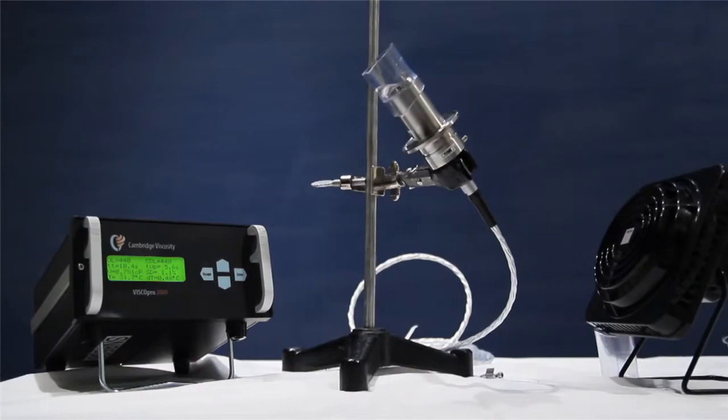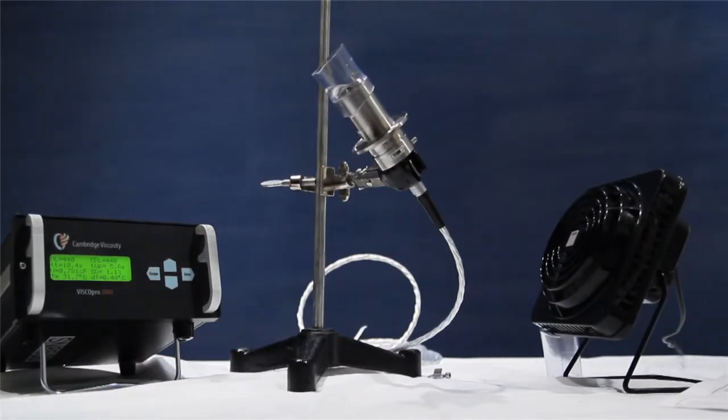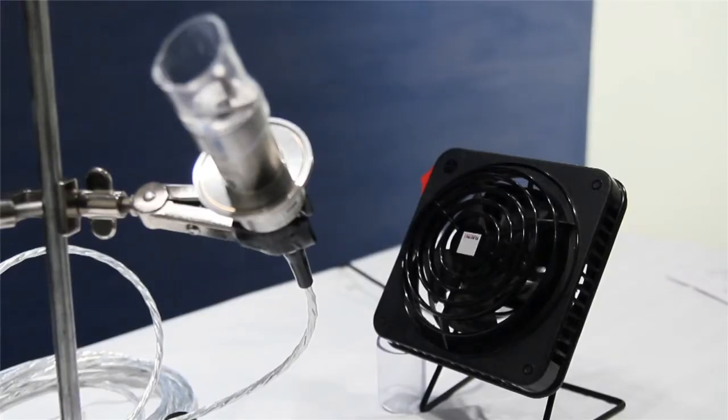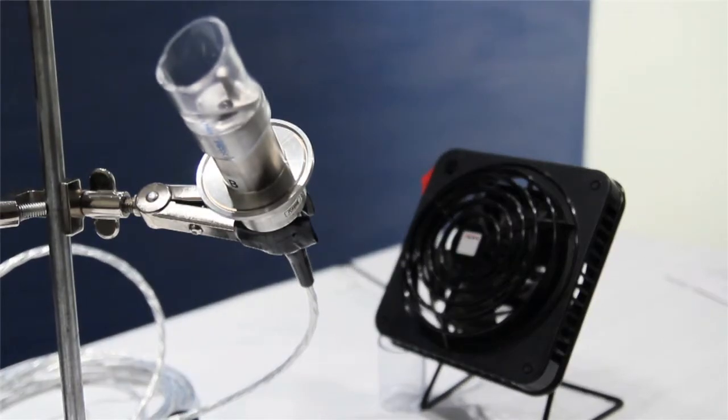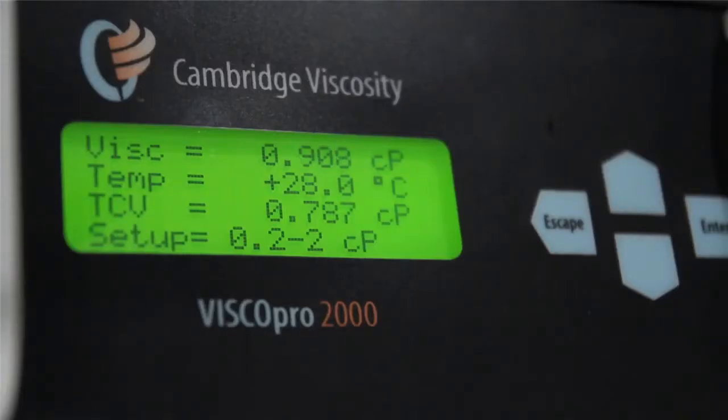Step 3. Place a small desk fan a short distance from the sensor. The fan is used to mimic fluid flow around the sensor and to assist it to reach thermal stabilization. The sensor will now thermally stabilize. This should take 5 to 10 minutes.